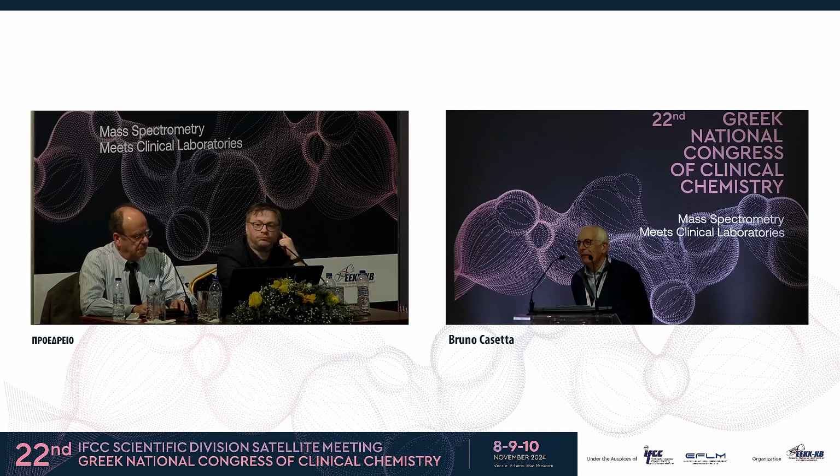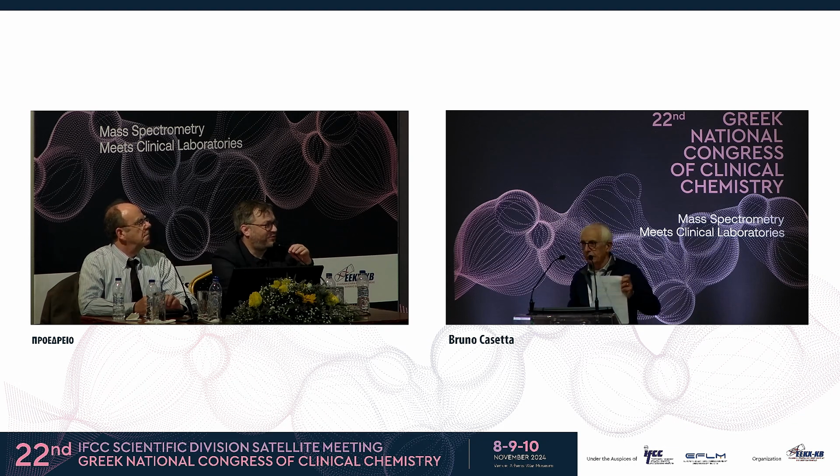And the second part of my question was the secondary amines were more difficult to derivatize. Have you corrected that with this new mechanism of derivatization? Yeah. So we'll get a higher recovery of proline and other secondary amines in the amino acid profile. Thank you. Okay. Thank you very much, Bruno.